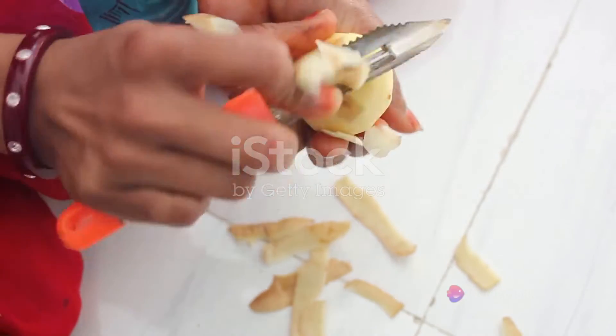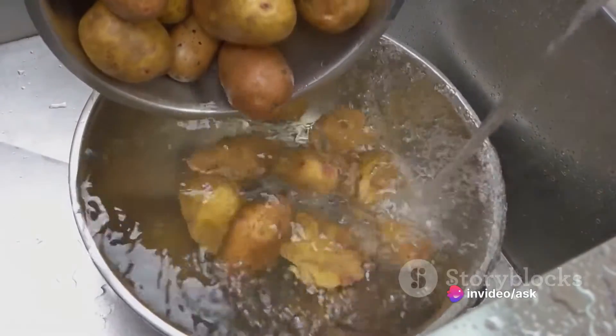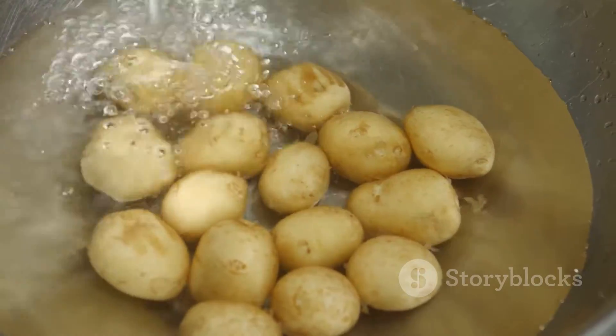Now, observe the changes. The potato cylinders in beaker A, which held distilled water, increased in length. This is because water molecules, which were more concentrated in the beaker, moved by osmosis into the potato cells, causing the cylinders to swell.